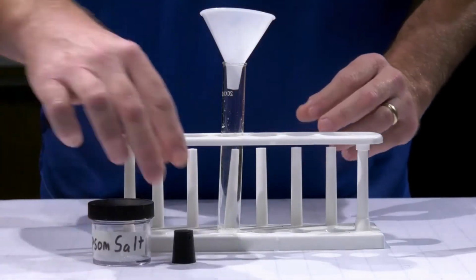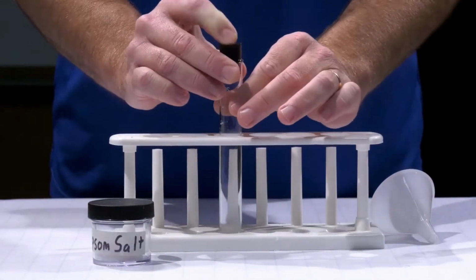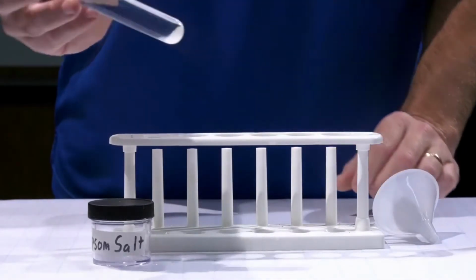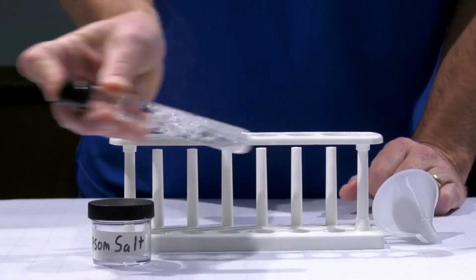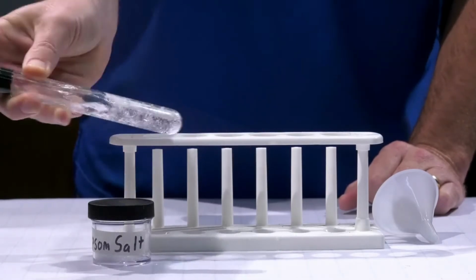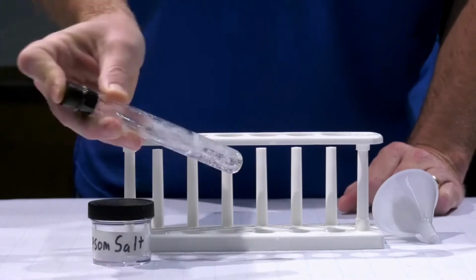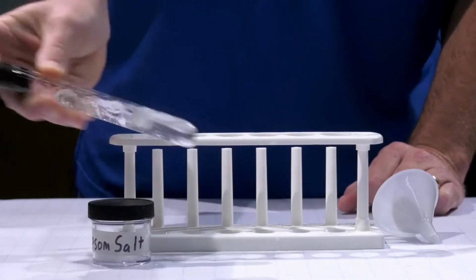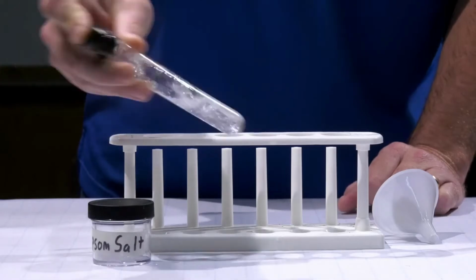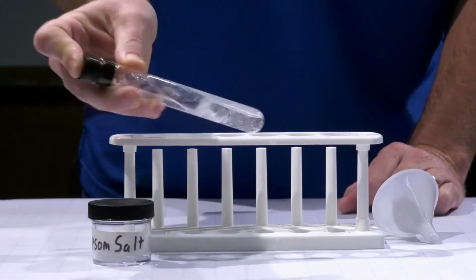And these already, based upon how big they already look different within that test tube. So shake, shake, shake. Still shaking.